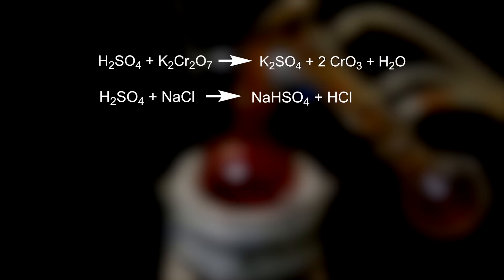What is happening are three different reactions. At first, concentrated sulfuric acid reacts with potassium dichromate, to form potassium sulfate, chromium trioxide, and water. Concentrated sulfuric acid also reacts with sodium chloride, to form sodium hydrogen sulfate, and hydrogen chloride. Chromium trioxide and hydrogen chloride then react, to form chromyl chloride, and water.